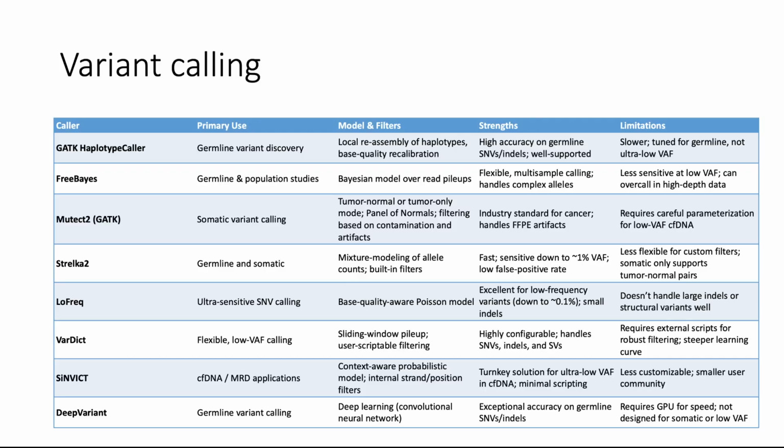Different variant callers have their own strengths and limitations, and for our purpose most interesting will be VarDict, as it focuses on low variant calls, and another one, SINVICT.